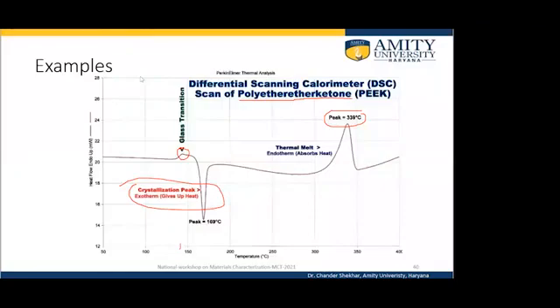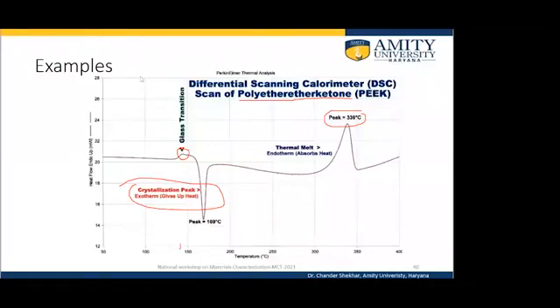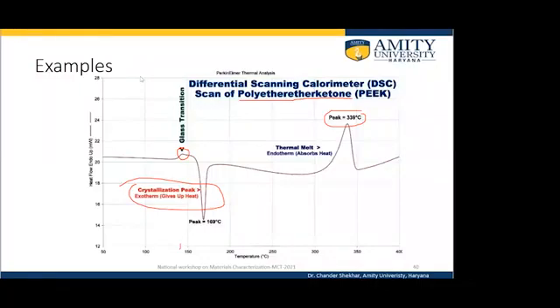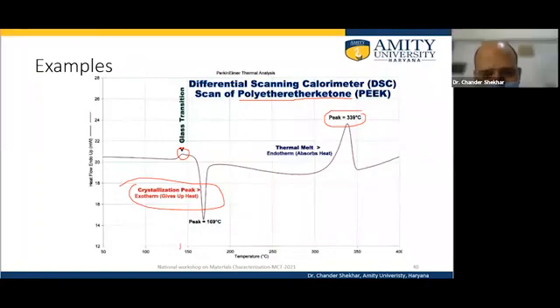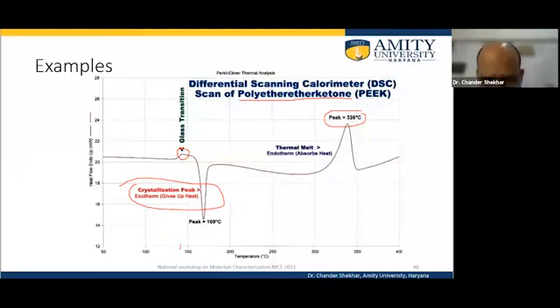There's a query from Brijesh Kumar. Is heating continuous, or can it be transient? Heating on the setup is only continuous.